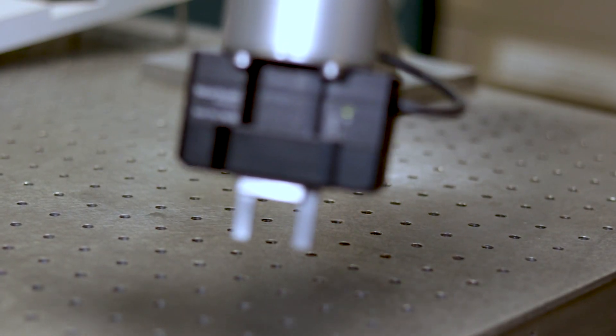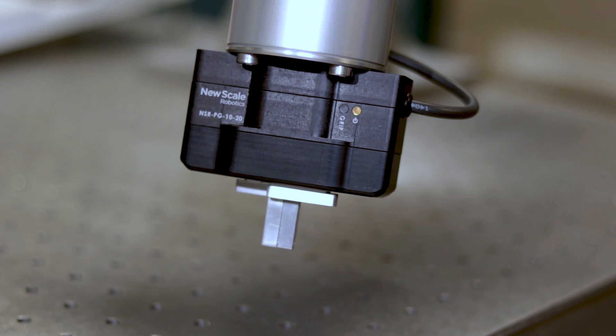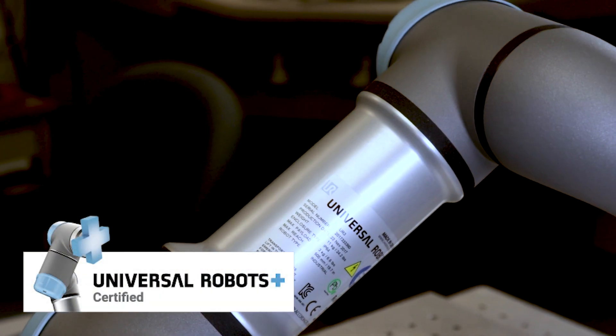NewScale Robotics is proud to introduce the NSRPG, the smallest, most precise electric parallel gripper that plugs and produces on the Universal Robots collaborative robot.